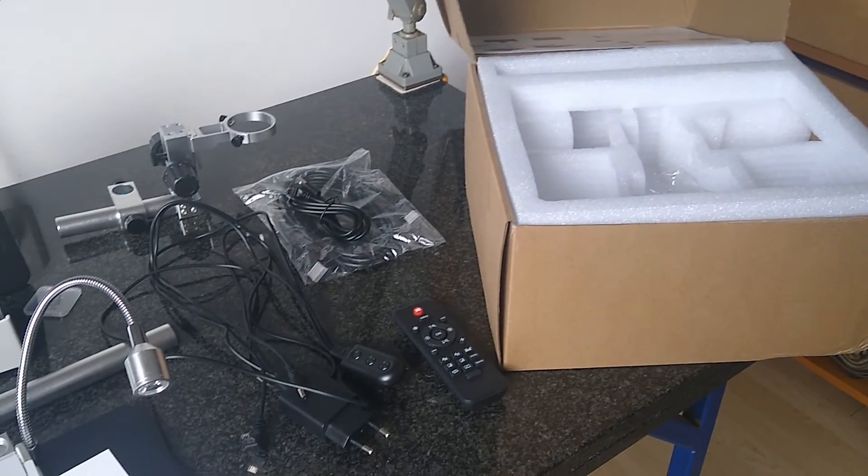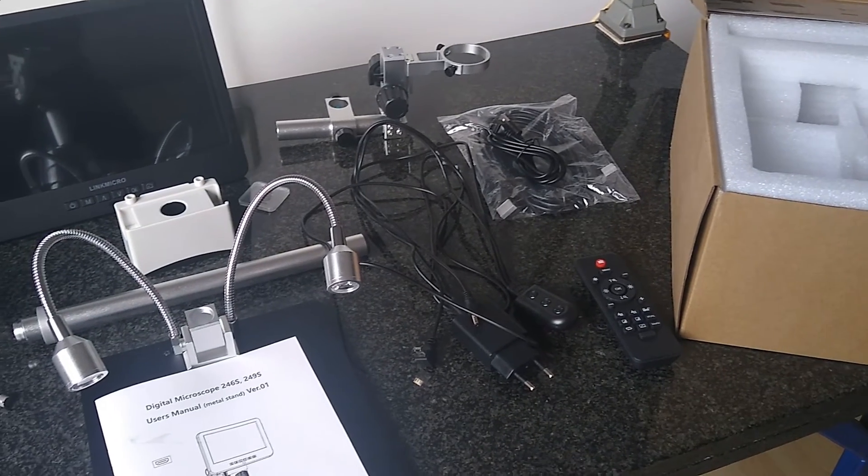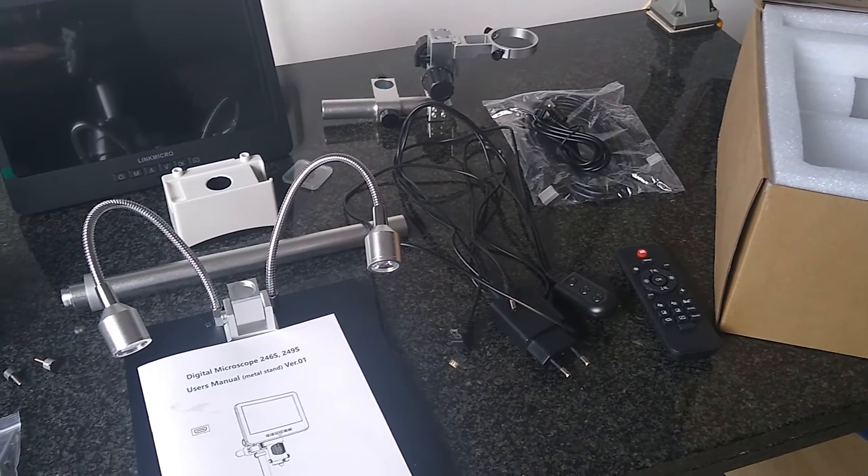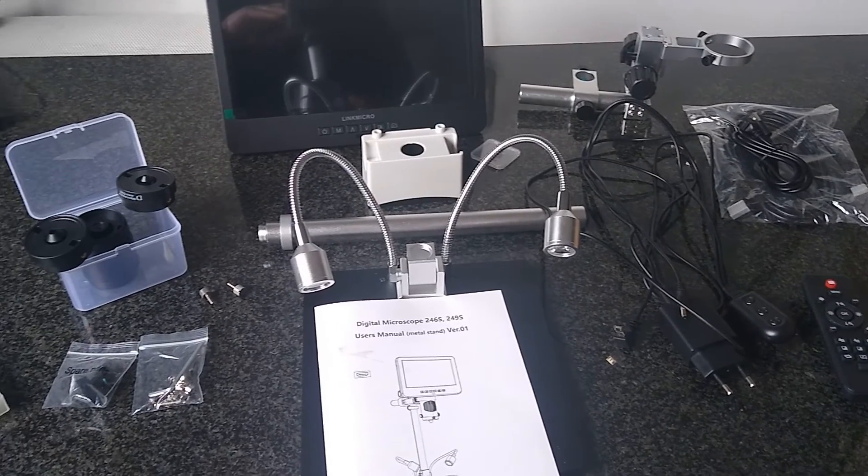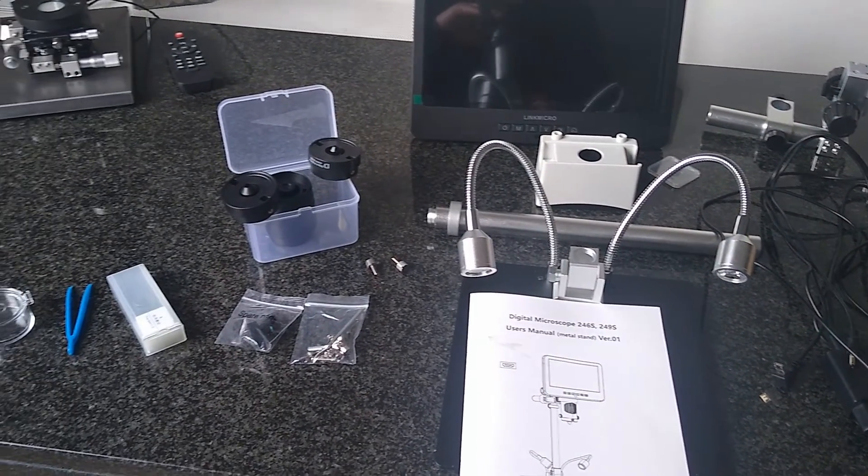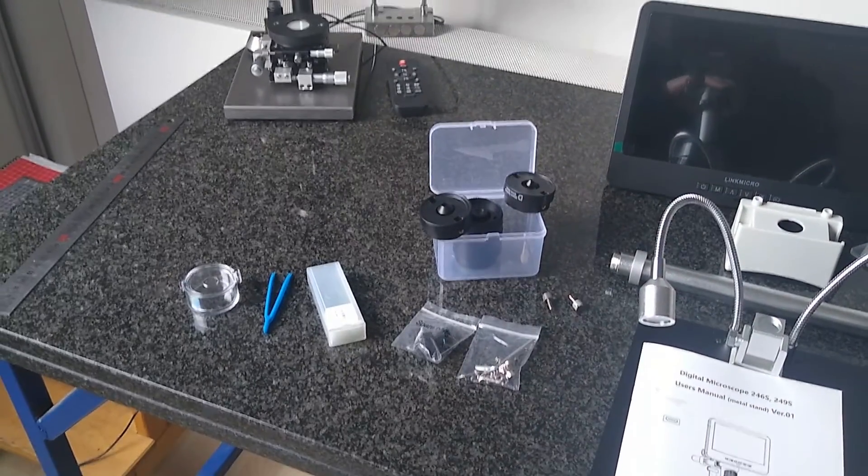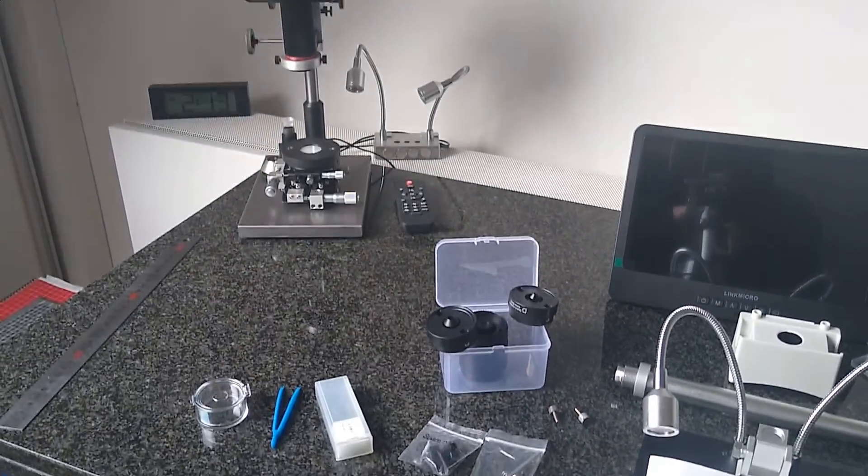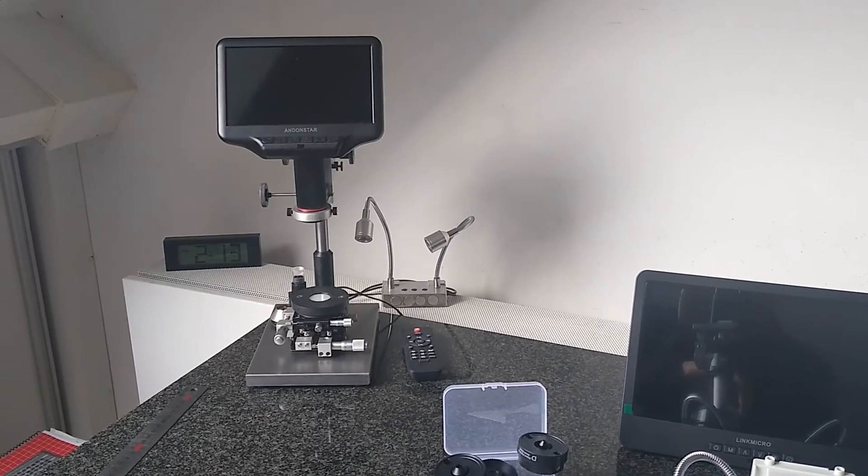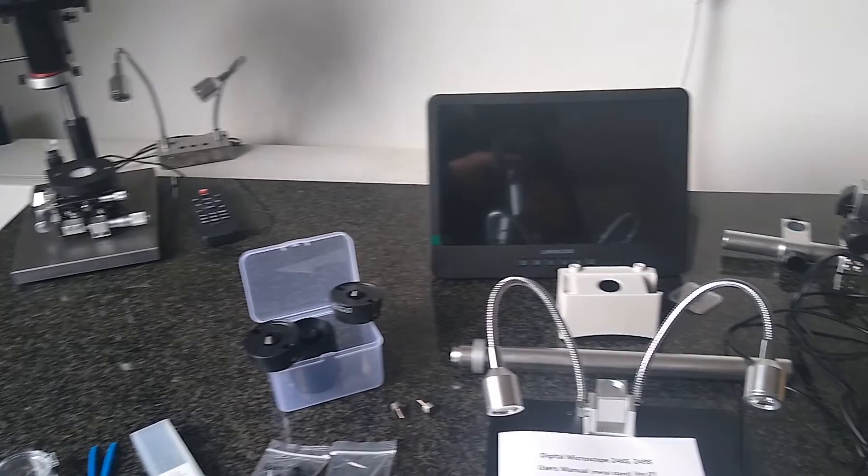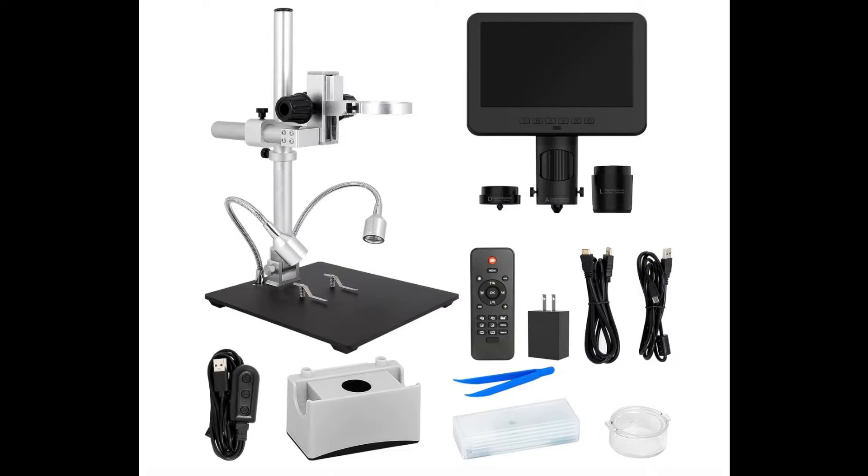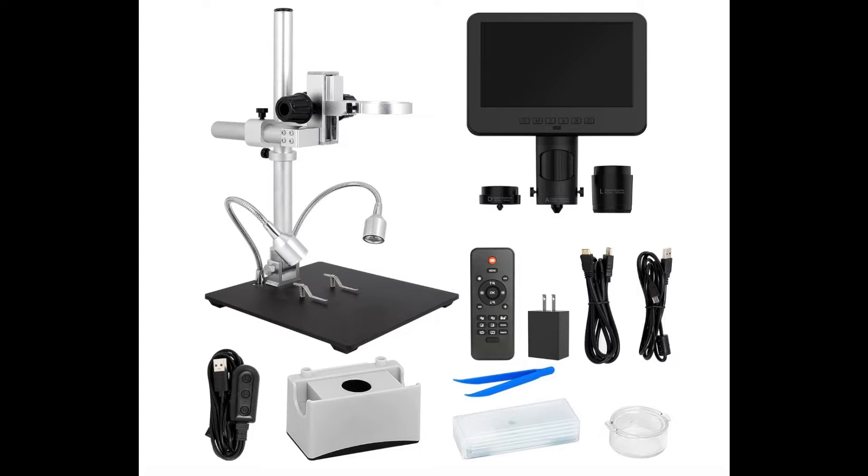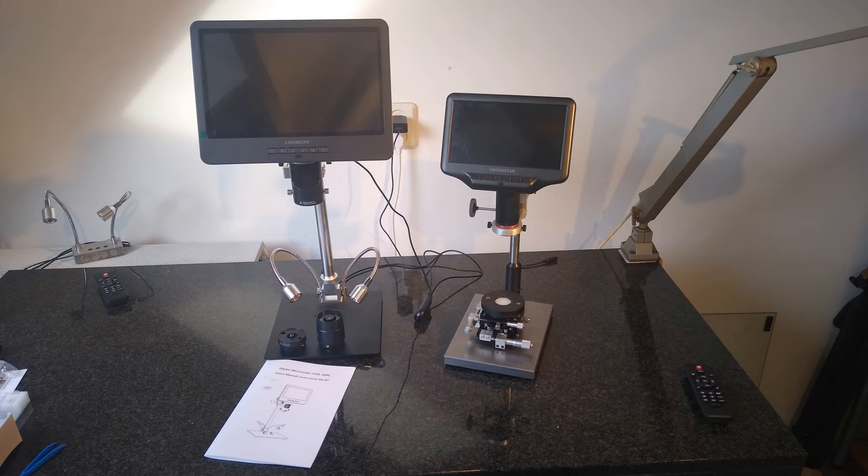The microscope was sent excellently packaged and equipped with all kinds of extras. In addition to the housing and base, three lenses are included. A USB and HDMI cable are also included, and of course the still somewhat messy chaotic cable with four ends for the power supply. Because one of the lenses enables high magnification required for transmission microscopy, a very simple light box and five biological preparates, a sample box, and a pair of plastic tweezers are included. Even a bag of spare bolts and a 32GB SD card are in the box. A very concise manual and the same annoyingly slow remote control as with the AD407 complement the extensive equipment.